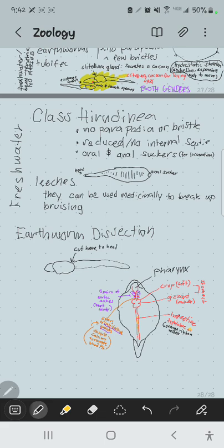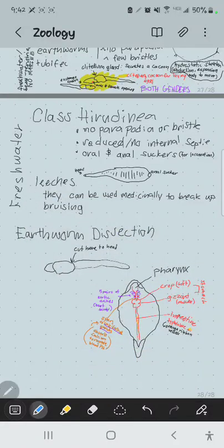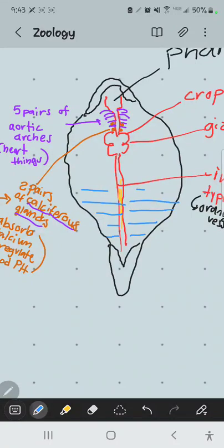All right, lastly, I mentioned that there are these internal septi. So the inside of the body basically is divided into compartments. And so you'll see this, when you tear it open, you'll probably tear a lot of septi, but take a look at the very back of your cut here. You'll still see some septi intact. And I'll probably ask you about septi on the section of the worm.